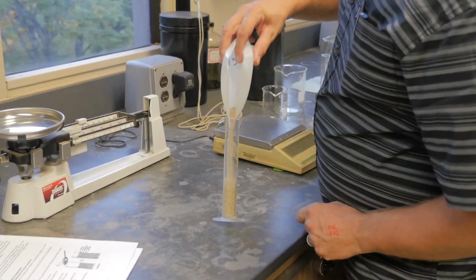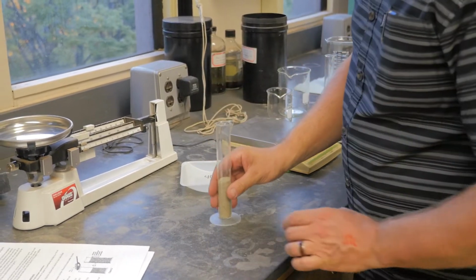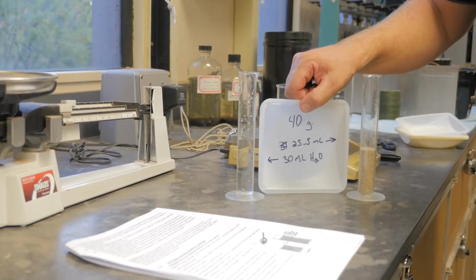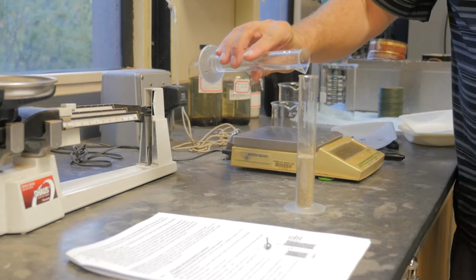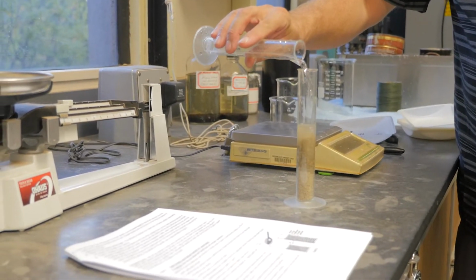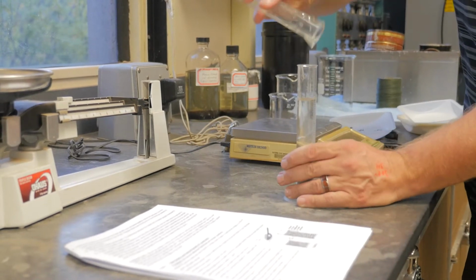So we took 40 grams of sand and poured it into the graduated cylinder. We weighed out 30 milliliters of water and poured them together, and we ended up with a 46.5 milliliter volume. So the total volume of solids plus water was 46.5 milliliters.